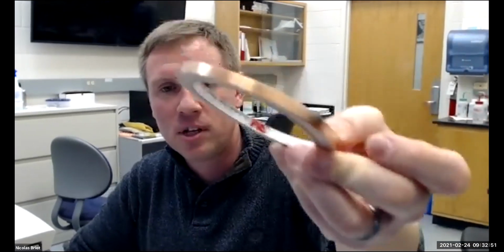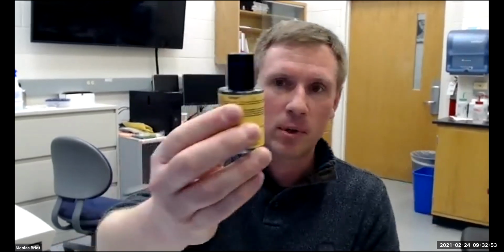So we can use tapes like this, just copper tapes. We have some conductive paint. This is graphite paint. You just paint the surface of your sample and the solvent leaves, and you leave behind some conductive layers. Of course, you don't want to paint the surface of your sample, but close to it, you just want to give a path for the electrons to go somewhere.